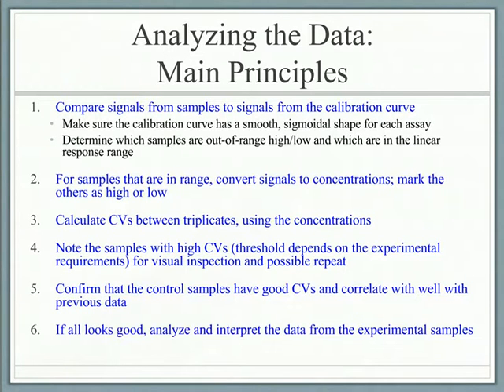considerations. If all looks good, then you can interpret the data from your experimental samples. And that would be according to the experimental design and the purpose of the experiment. If it's a case control experiment, doing the statistical analyses according to differences between cases and controls, and so forth. These considerations here hopefully get you to the point where you are able to get reliable, interpretable data. And those are the main things I wanted to cover. I will be happy to address any questions after the other speakers present.